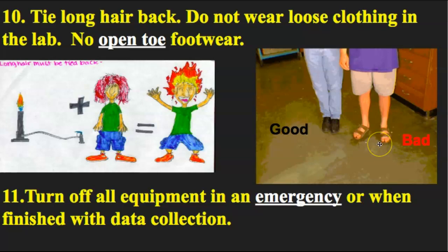The open toe shoes or sandals, flip-flops, whatever you want to call them, are a major hazard because if you drop something on your foot, you have no line of defense between that object that falls and your skin, which could potentially lead to cuts, chemicals getting into your bloodstream, and it's just a bad situation.